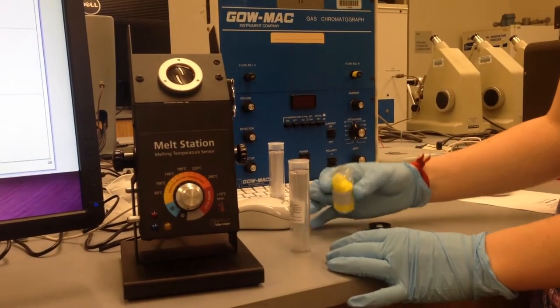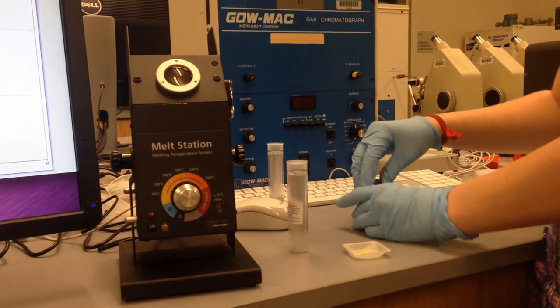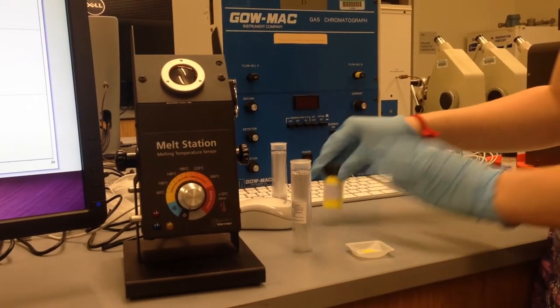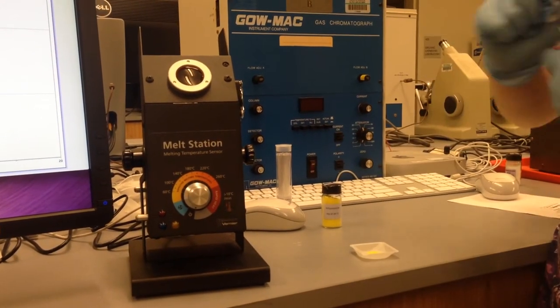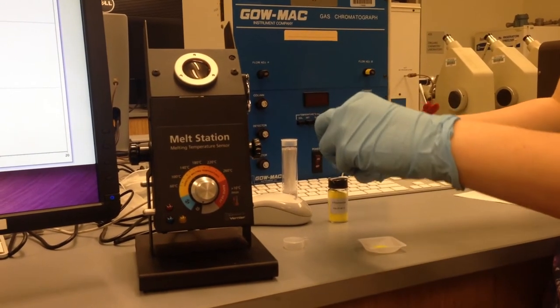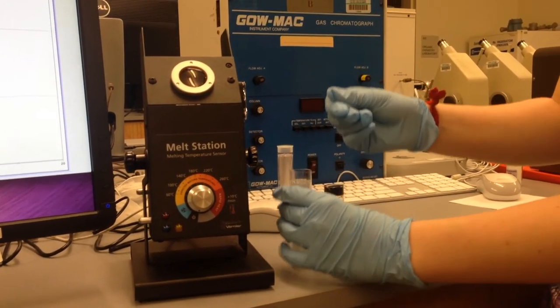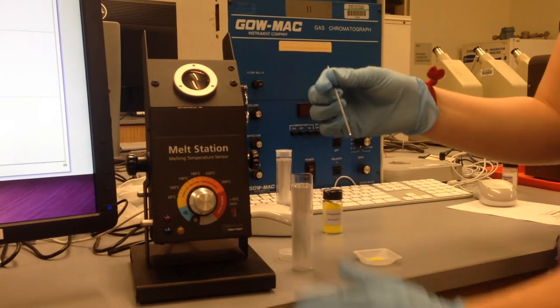Pour out some sample into a small weighboat. This will make sure that the rest of the sample in the vial doesn't get contaminated by the capillary tubes. As for the capillary tubes themselves, this is where the sample will be doing its melting. They are open on one end and closed on the other.